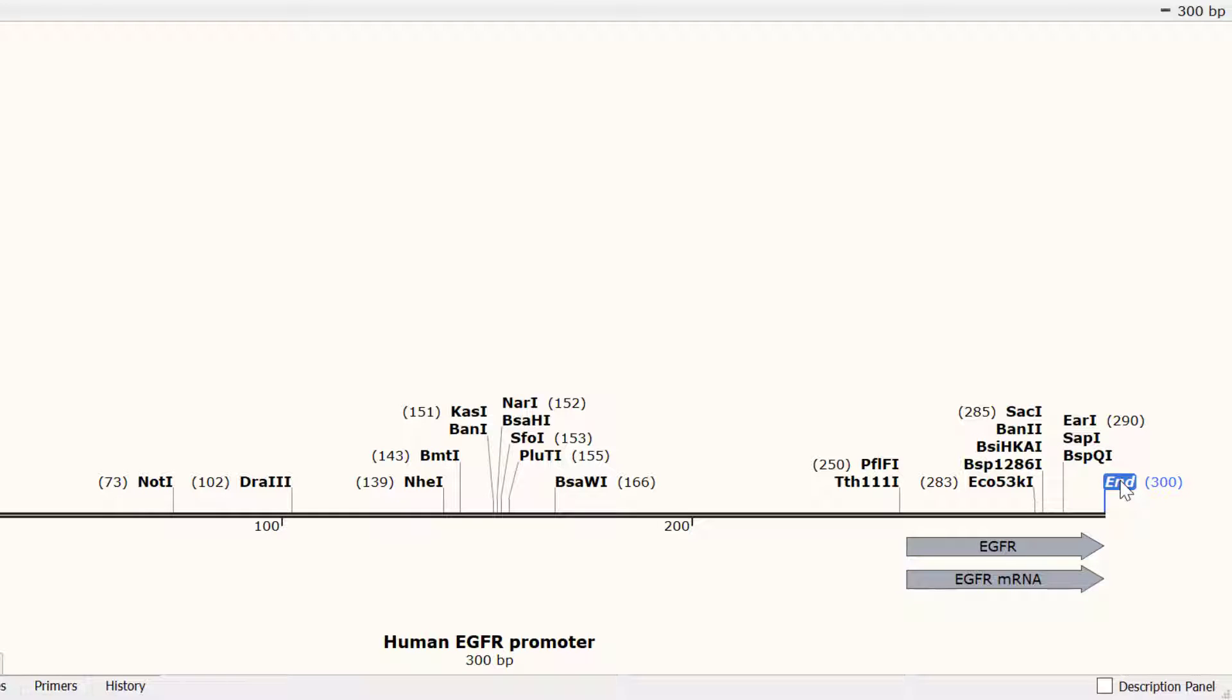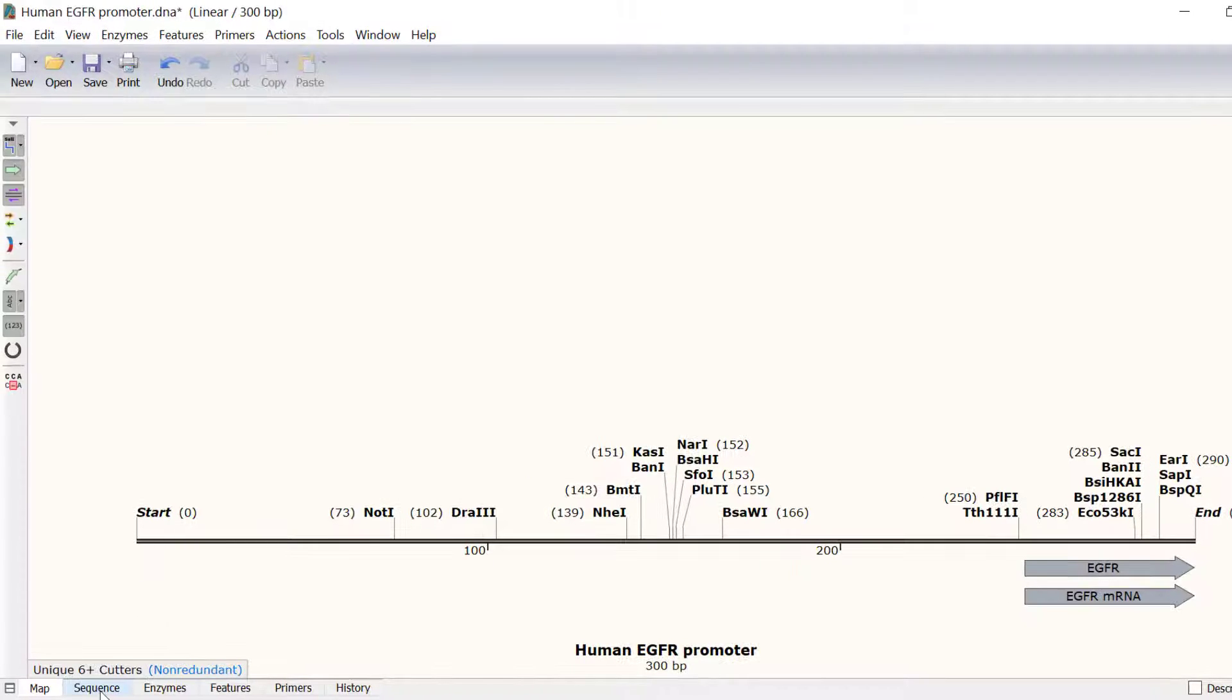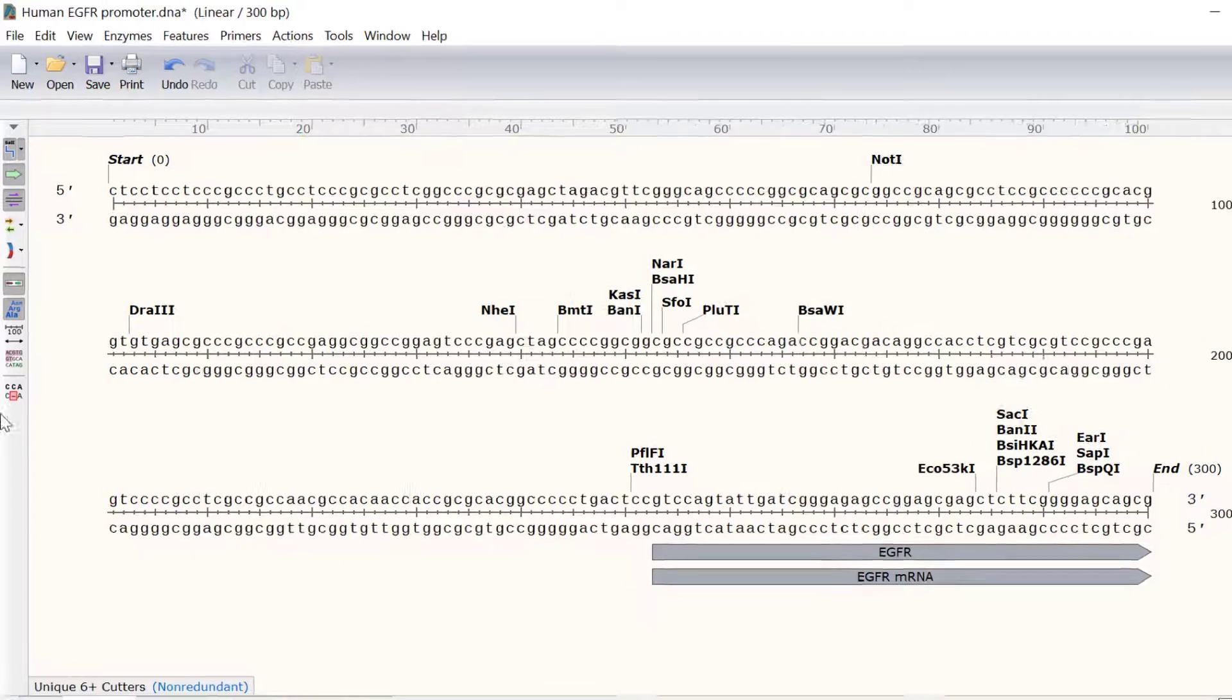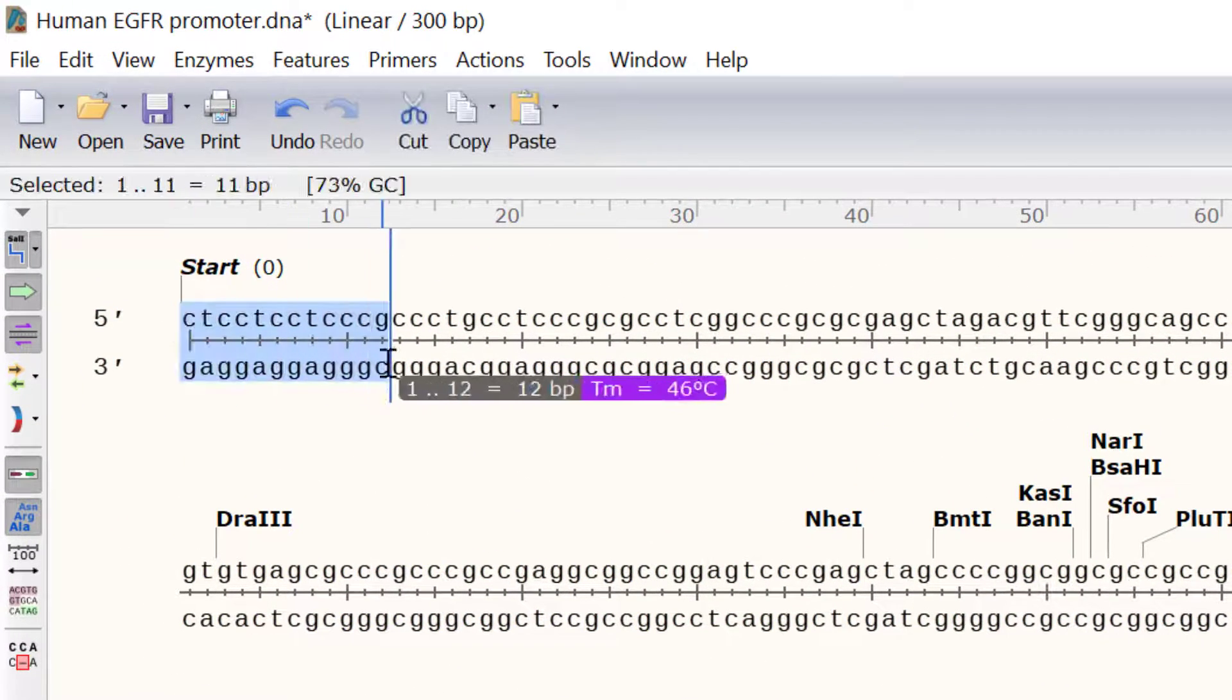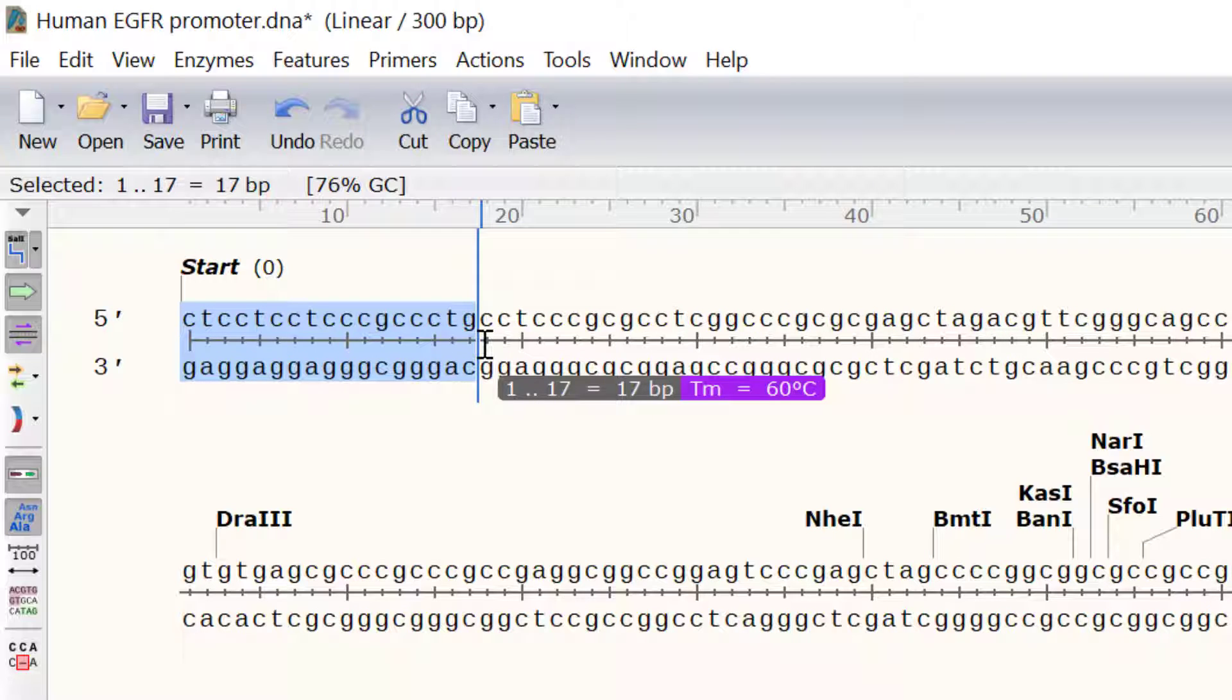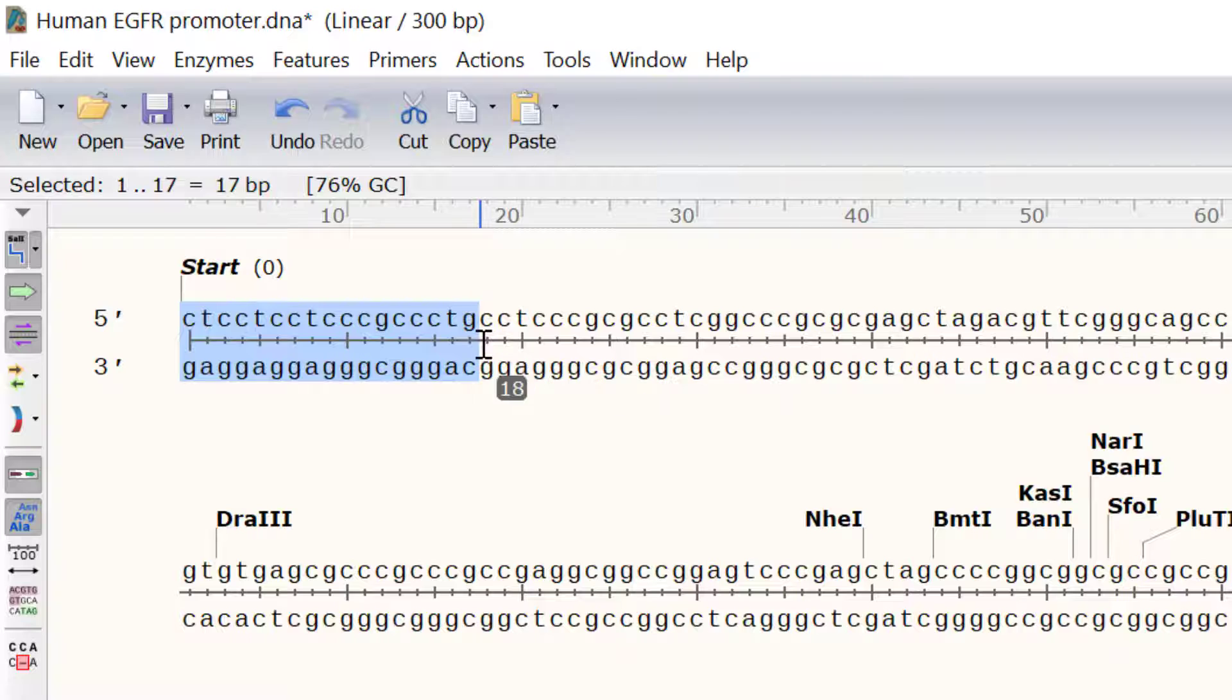Let's create the forward primer. To do this I will switch to the sequence view and click and drag on the sequence that I want to be the primer. I want the primer to have a melting temperature of approximately 60 degrees. As I click and drag to make the selection, SnapGene provides real time updates on the melting temperature based on my selection. In this case the first 17 bases will give me a melting temperature of 60 degrees Celsius.